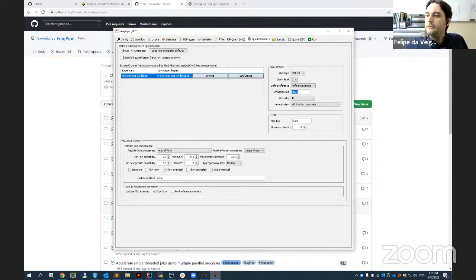Okay, well, let me see the other questions. Mark is asking about the cores. Those numbers are okay, like physical core 8, 16. That's fine. That's usually what we use. Any standard good processing server is fine.